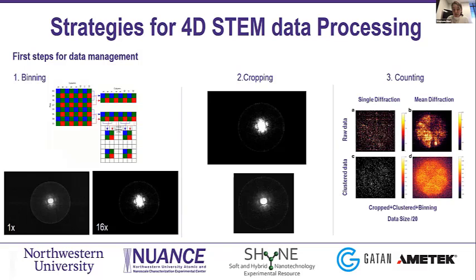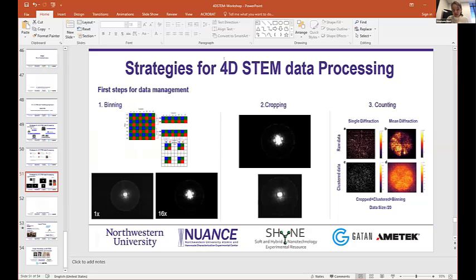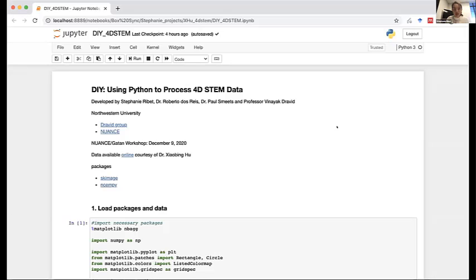That is good. Thank you, Roberto. The first thing I'm going to do is drop a link in the chat. I'm going to share my notebook and my data for this session with you, so feel free to download it now and follow along, or do so later. And then I will share my screen.